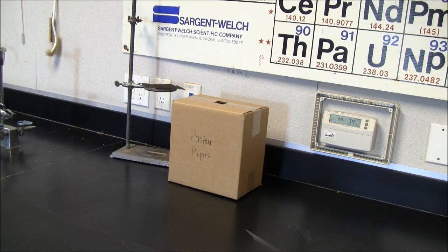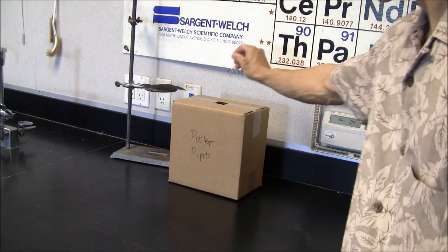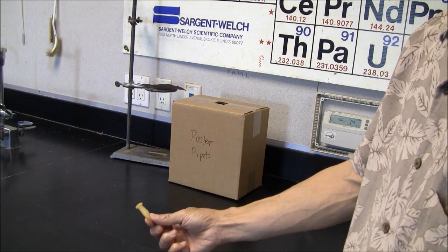When you're finished with a Pasteur pipette, you have a box for disposing of the glass part. The rubber part is reusable.